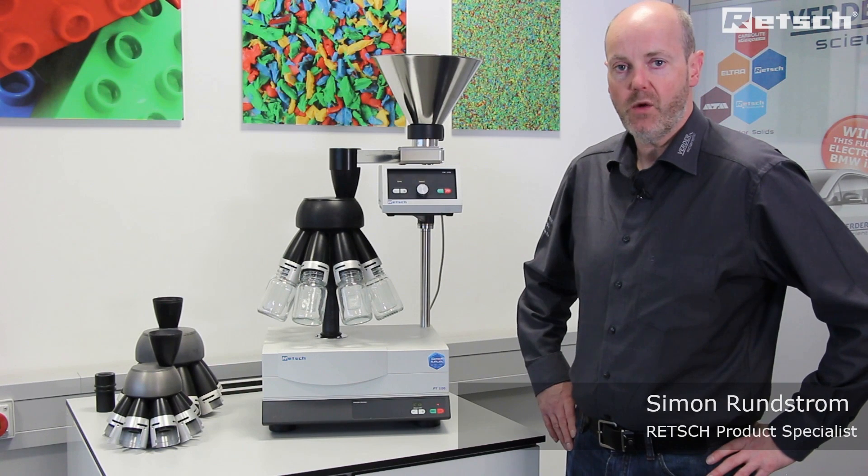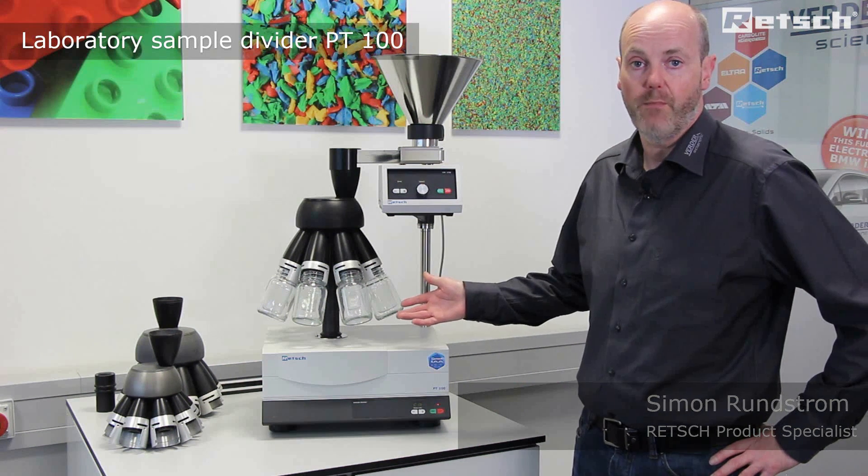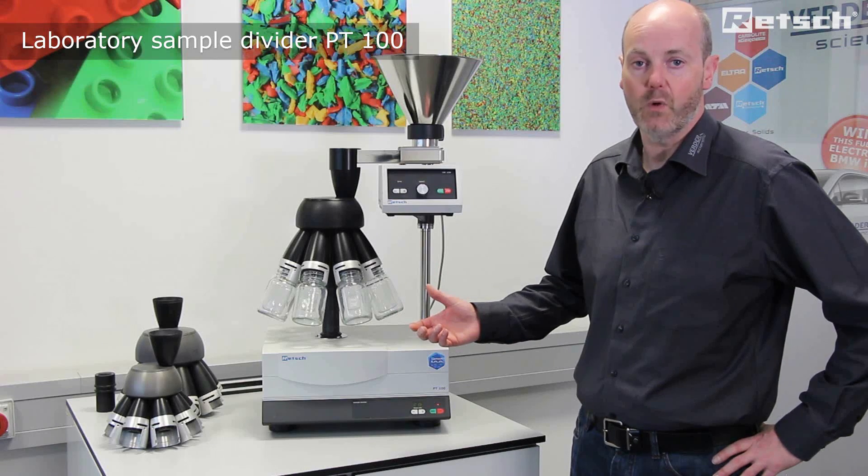Hello. I'd like to take this opportunity to introduce the PT100 laboratory sample divider, which is a bench top instrument within the family of sample dividers.